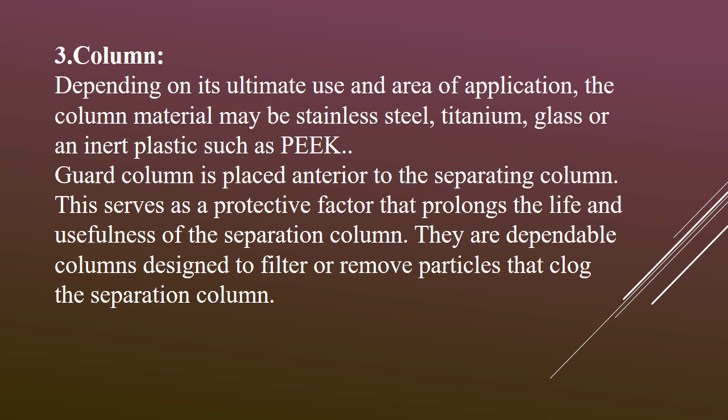The guard column is placed anterior to the separating column. This serves as a protective factor that prolongs the life and usefulness of the separating column. They are dependable columns designed to filter or remove the particles that clog the separating column.